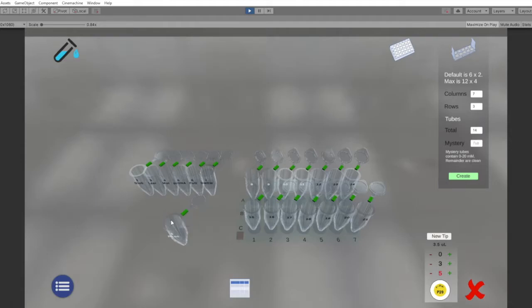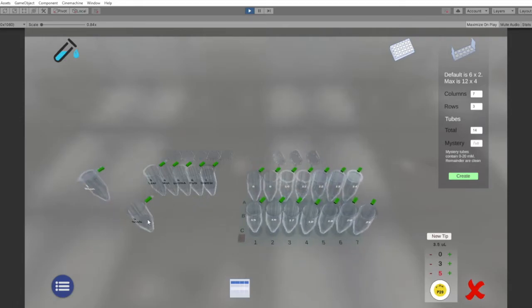And now I'm going to use the pipette to pipette 3.5 microliters of the vanilla into each of the tubes. And obviously when you do this, it's going to be painful and very, very slow, but I've just speeded up time here. Now I'm opening the lids of the tubes that I'm going to put the globin in, and you can see when I put the globin in, their little tabs have gone red, which shows that they're not mixed. So green means mixed and red means not mixed.